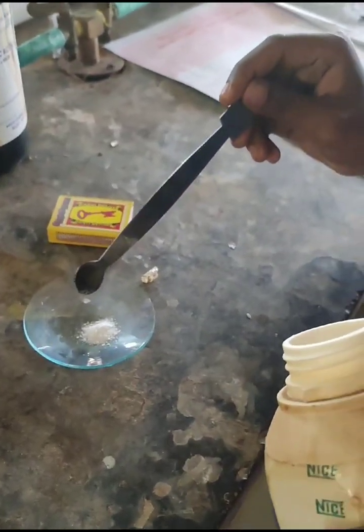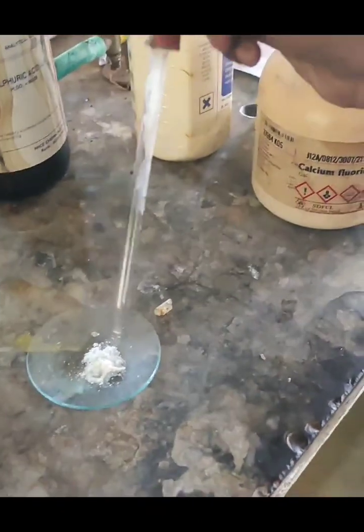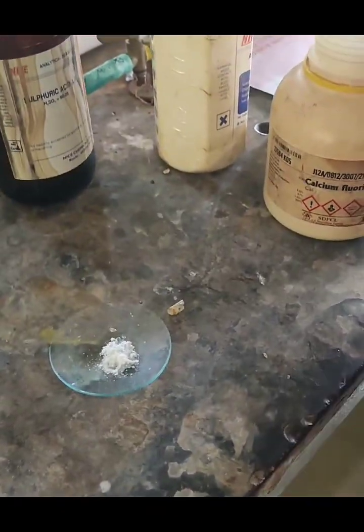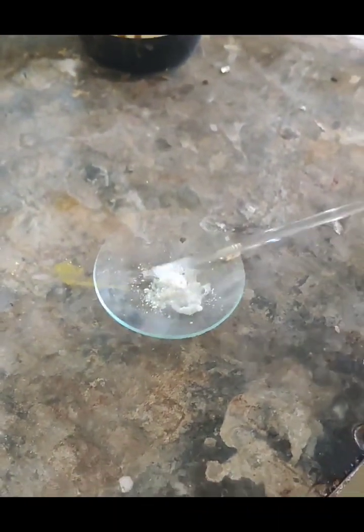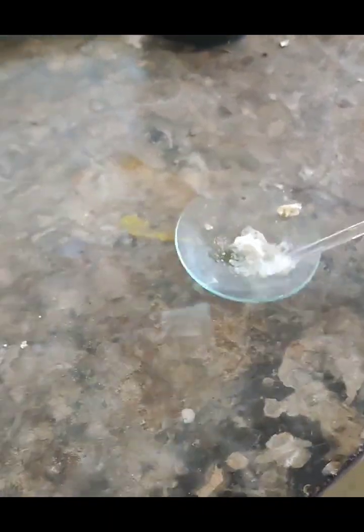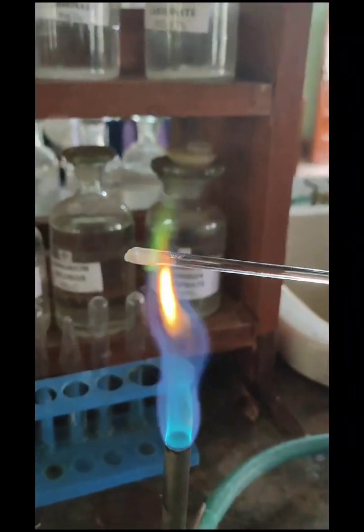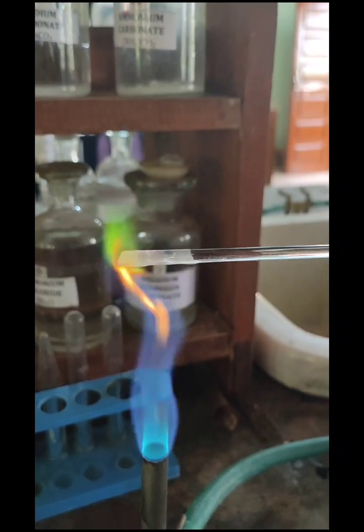For the borate test, take around 5 mg of salt. Add a small quantity of concentrated H2SO4 and thoroughly mix it. Form a paste using a glass rod, take the paste on the glass rod, and bring it close to the flame. As we can see the green color flame, the borate is present.